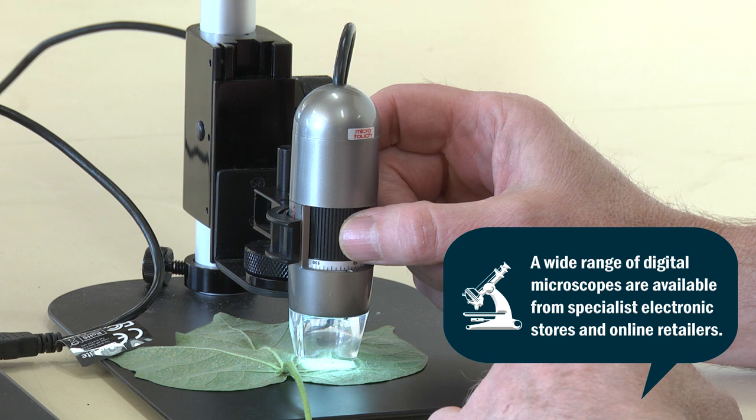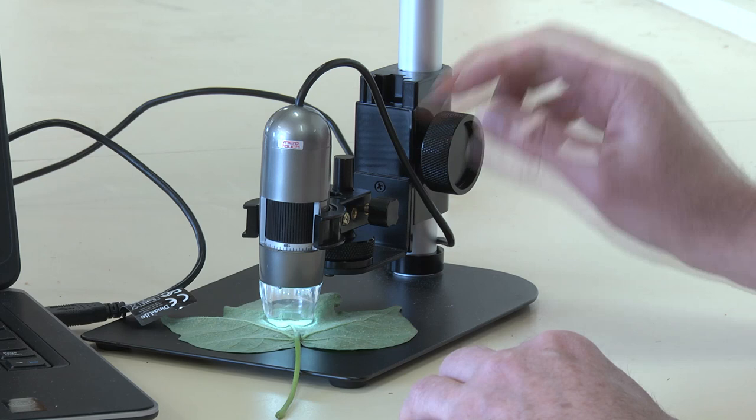The microscope we're going to use today is a Dynolite. To adjust the magnification you just use the focus controller here. It has a magnification from 50 to 200 times.